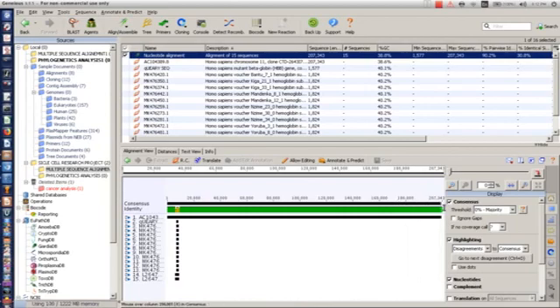This is the consensus. Now the consensus determines the similarity, or the measure of the similarities, that the nucleotide sequences are supposed to have. You get what I'm saying now? So that is the essence of consensus identity. The actual nucleotide bases that are supposed to be equal in the sequences are what we have on this consensus. And consensus also determines the rate of alignment, in terms of similarity and differences between sequences.